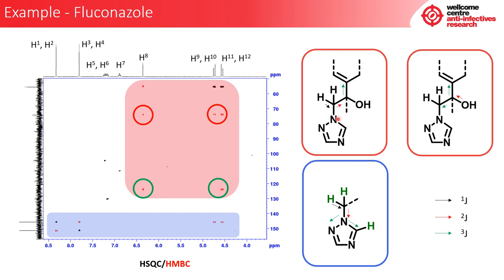Going in the opposite direction, we're hitting aromatic peaks here. So this is the quaternary carbon. So remember I said to you before that the HMBC can measure 3 bonds away, but it is optimal and it's set to read at about 10 Hz, which is approximately 2 to 3 bonds.